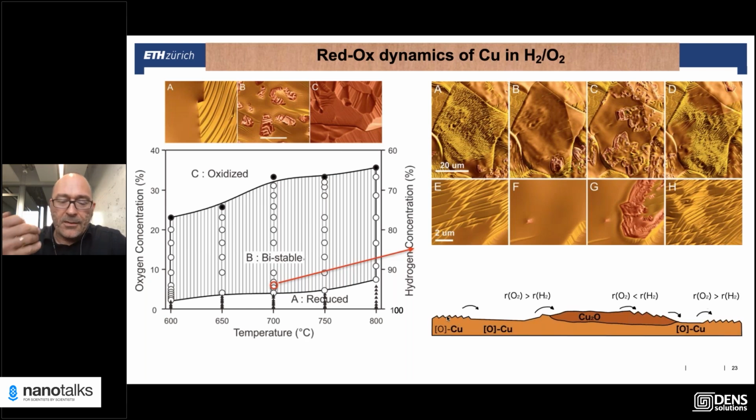So the oxygen can induce surface reconstructions. There are some very stable surface reconstructions induced by oxygen. They can persist quite long. And it takes some time until this oxygen reconstruction is lifted by even more oxygen on the surface. Then you get it in this flat state. This flat state is quite interesting. That's the precursor phase to oxide growth.